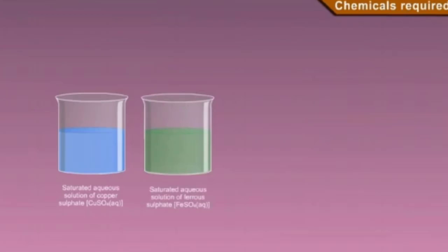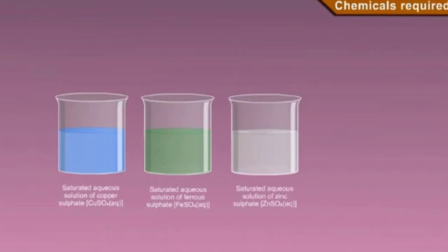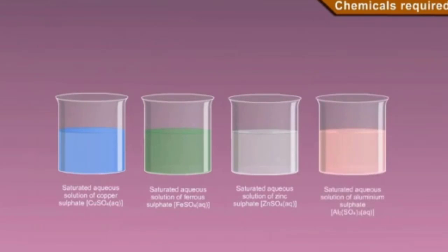Saturated aqueous solution of ferrous sulfate, FeSO4 aqueous. Saturated aqueous solution of zinc sulfate, ZnSO4 aqueous. Saturated aqueous solution of aluminium sulfate, Al2(SO4)3 aqueous.